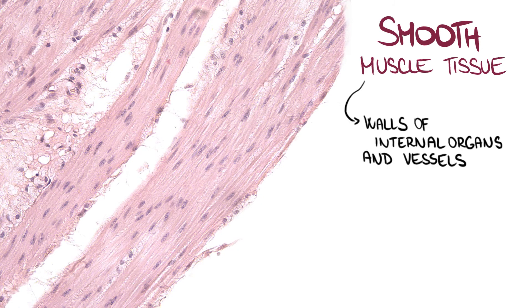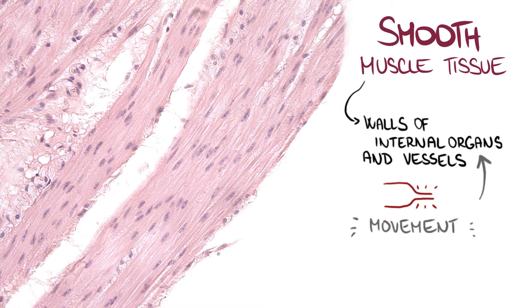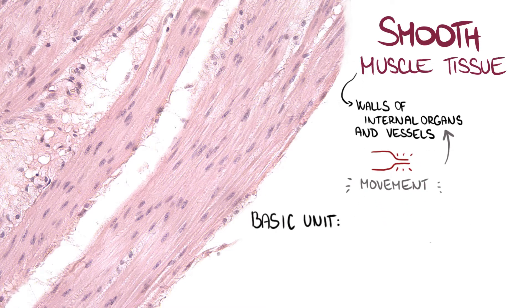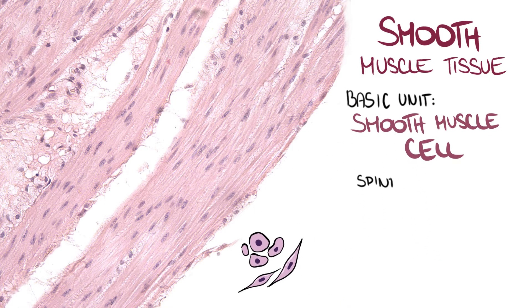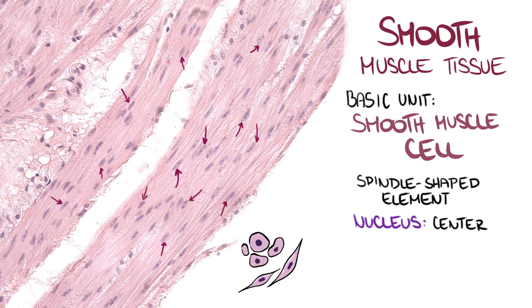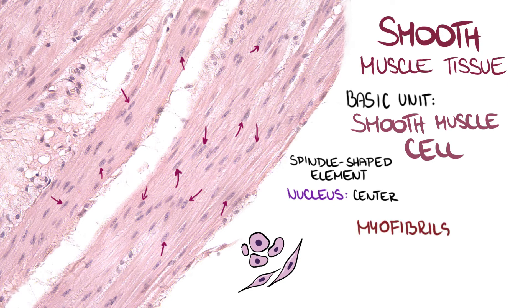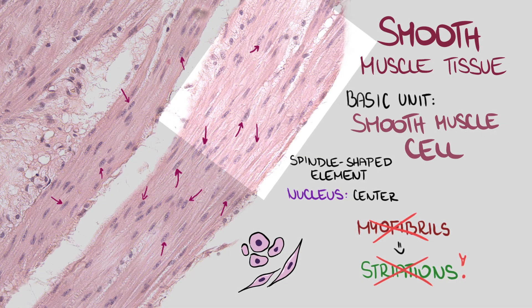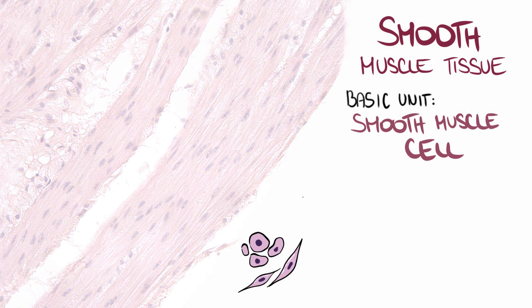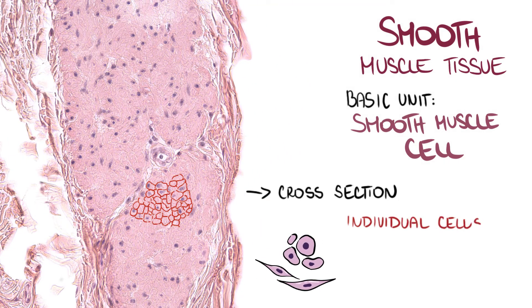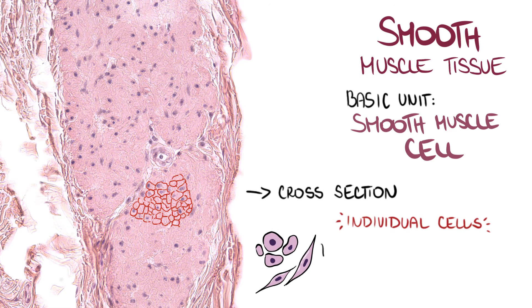Smooth muscle tissue makes up the walls of our internal organs and vessels. It's responsible for constriction of our vessels and for movement of contents inside our internal organs. The basic unit of smooth muscle tissue is a smooth muscle cell. It's a spindle-shaped element with one cigar-like shaped nucleus located in the center of the cell. It doesn't contain myofibrils, thus it's not a striated structure. In longitudinal sections we can appreciate a bunch of cells with nice nuclei, although we cannot distinguish their borders. In cross-section we can see individual cells. Length of the smooth muscle cell can be up to 500 micrometers, but its diameter is as small as 6 micrometers.